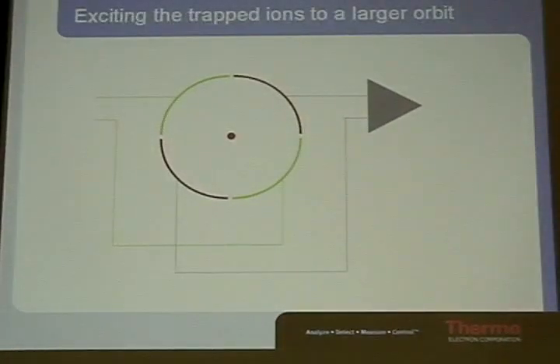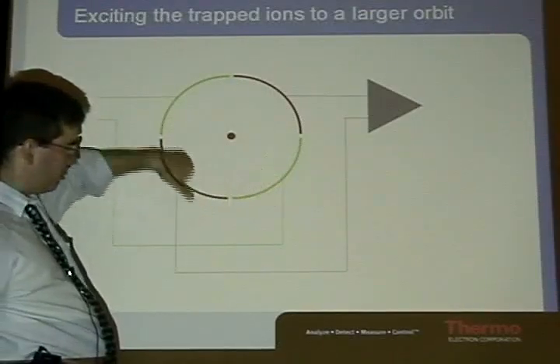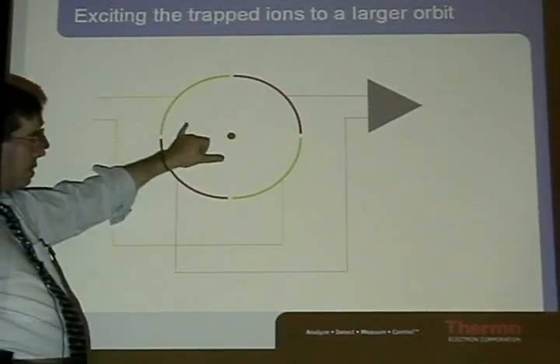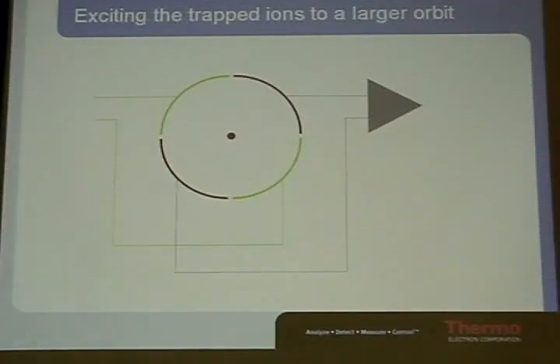Okay, now, the next question is how do we handle ions in the XY dimension? Our linear trap was 4 hyperbolic rods. Now what we have is 4 quarter circle pieces of copper plate. So we take very thin copper plate and we bend them to be quarter circle, quarter circle. 4 quarter circles, not halves. One set of rods are called excites, and one set of rods are called detects. So we have detect plates and we have excite plates.